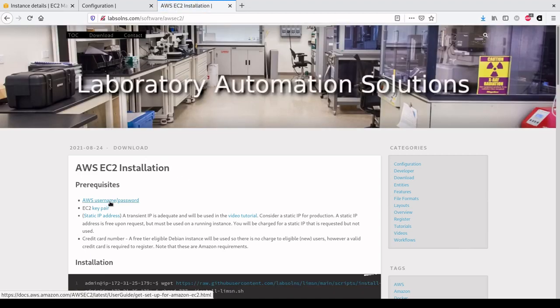These hyperlinks will take you to Amazon and provide you with instruction for accomplishing each step.